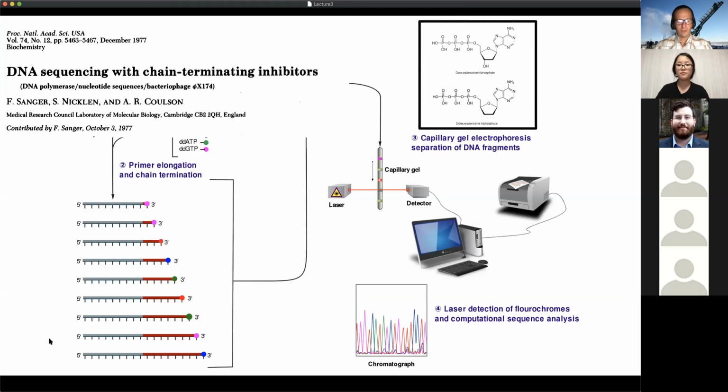I think it's worthwhile to go back to the time when I was a little kid, the late 1970s, to recall the genesis of modern sequencing. At the time, there were two competing techniques for sequencing. So the Sanger, who's the first author of what became popularized in the 1980s and was the dominant form of sequencing until the mid-2000s, called Sanger sequencing.